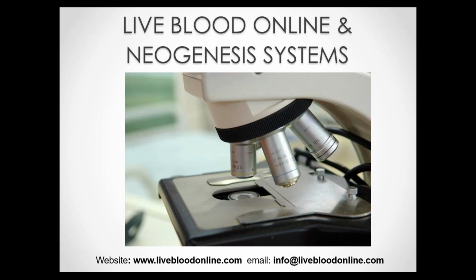Right, that is a very good question, and one that often tends to come up because we are looking at blood, and people expect us to see specific things with blood analysis. But it's important to mention that live blood analysis is not used as a diagnostic tool. Although there are some indications for specific disease processes that can be seen in the blood, because there is a fair degree of overlap with standard hematology, it's not really meant to be used to diagnose any specific disease. Now, in cases where indicators of a specific disease are seen, one would still need to follow the normal investigations and procedures to diagnose the disease.